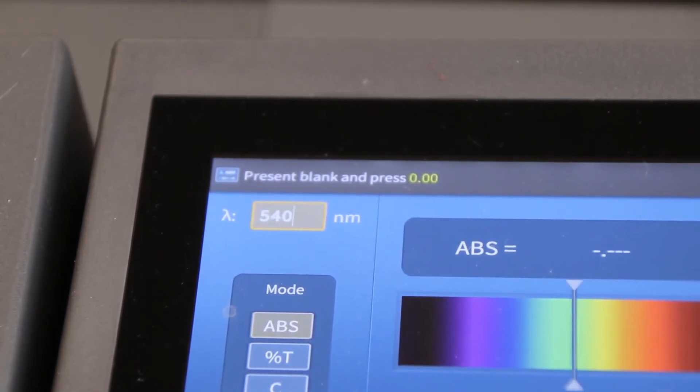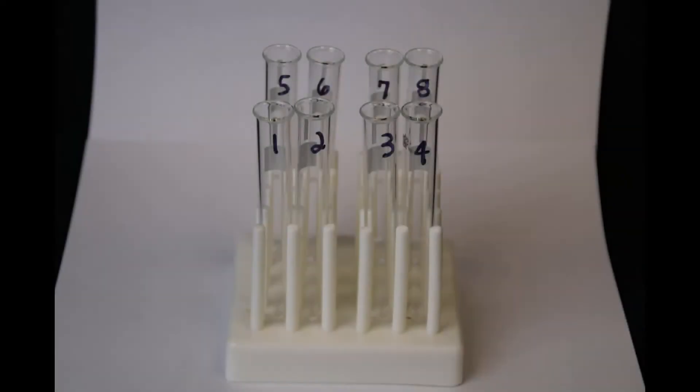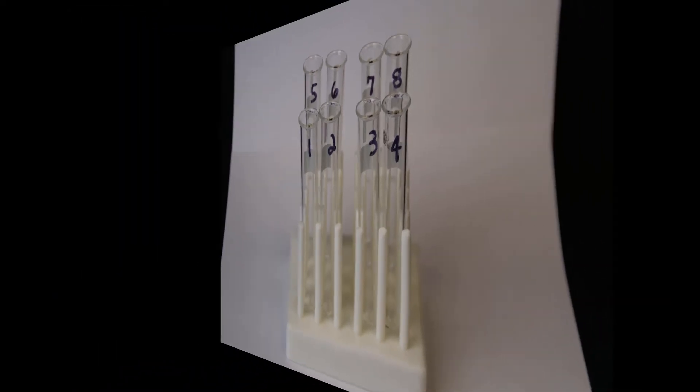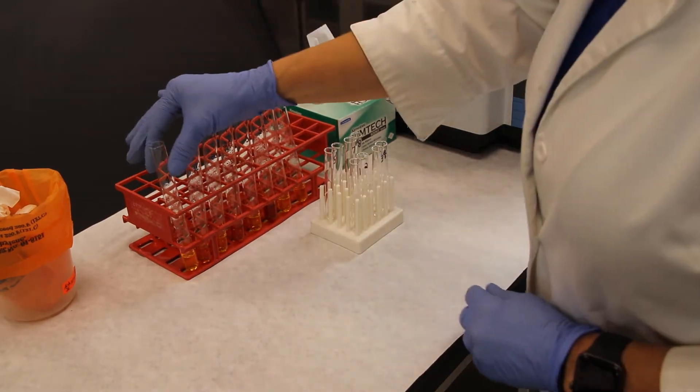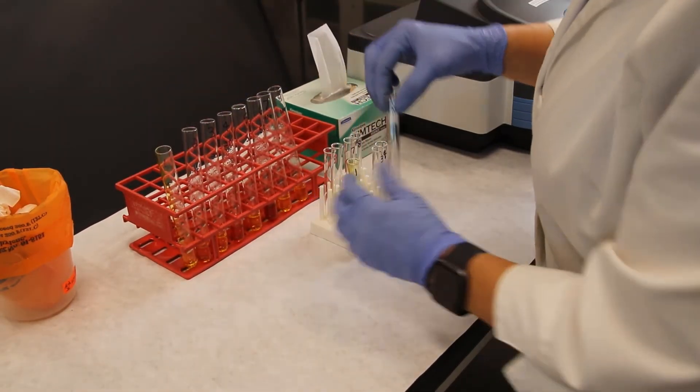We will be using glass cuvettes for our analysis. When you are in the lab you will label your cuvettes 1 and 2. Again for this video we will label them 1 to 8 to prevent confusion. Transfer the contents of the test tubes into their respectively labeled cuvettes.